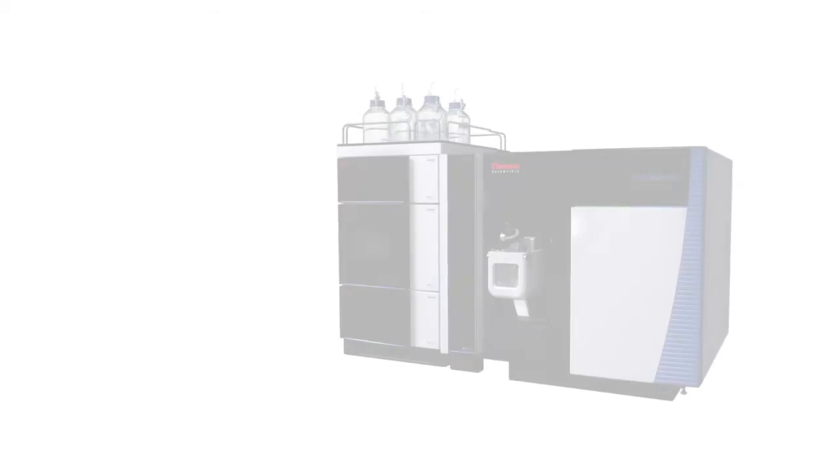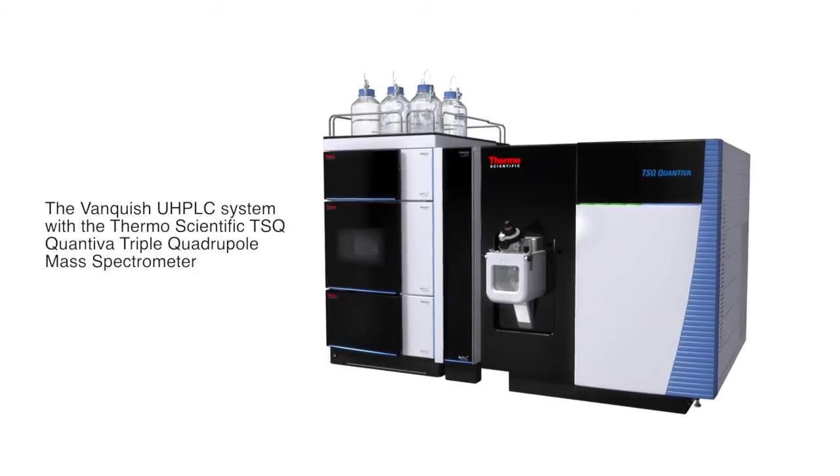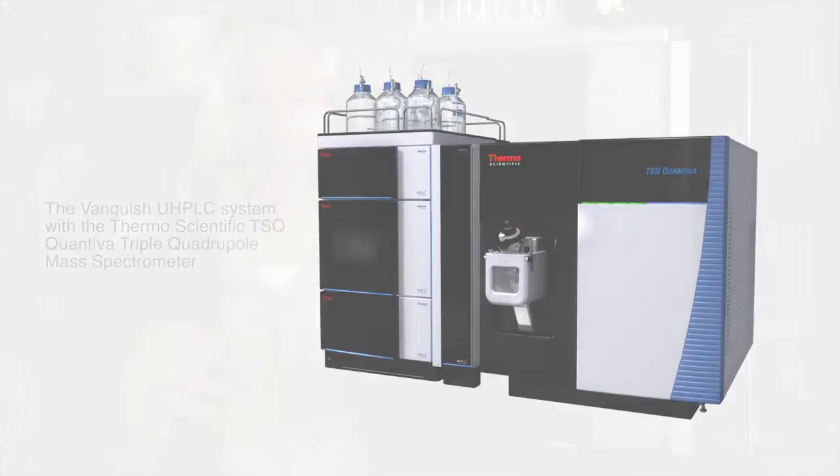Another main advantage to the Vanquish system is its ease of interface into any number of Thermo Scientific mass spectrometers. Our mass spectrometers have an extreme capability of analyzing, separating, isolating, quantifying just about any compound out there that any scientist would really want to get their hands on to say, what is this thing?